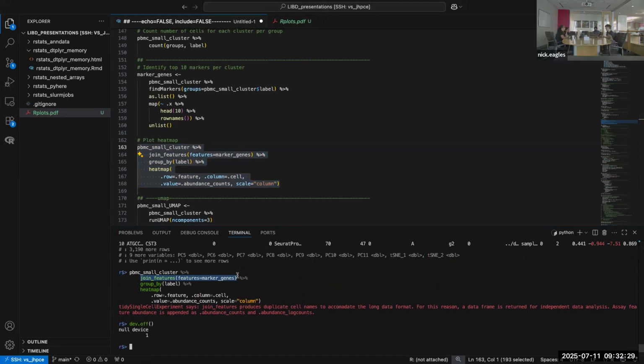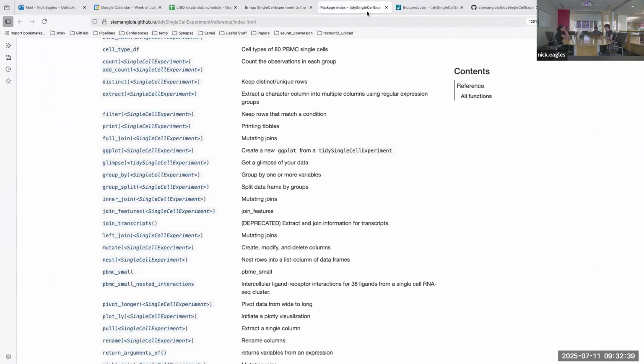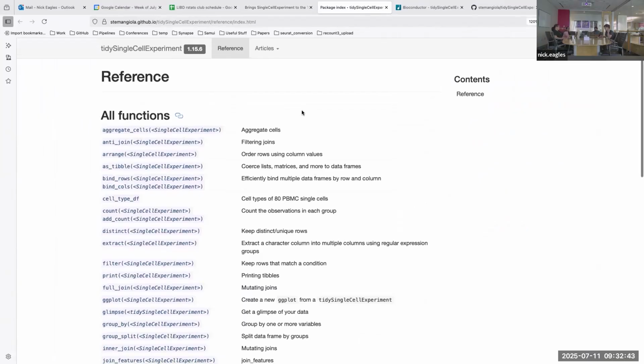They didn't add anything saying in which collection of functions they are creating new objects or not, right? Because they have a collection of functions there. For example, when you add the sample in your examples to the table, it looks like they really add the column to the colData. So I was wondering if they mention under a particular collection of functions that they are adding, or is it something else? Would you say it depends on the function?